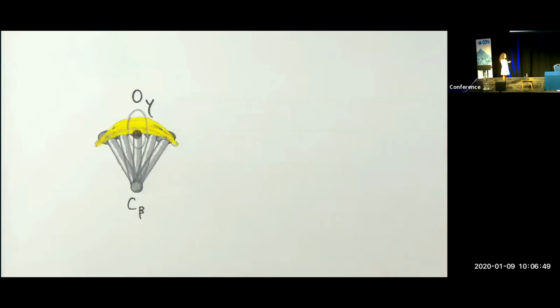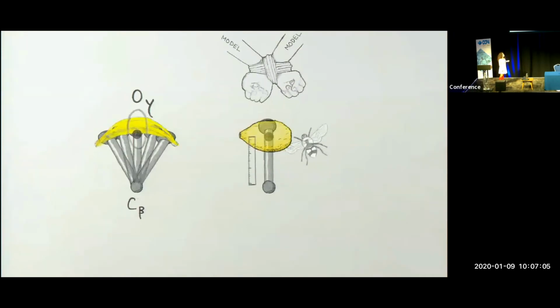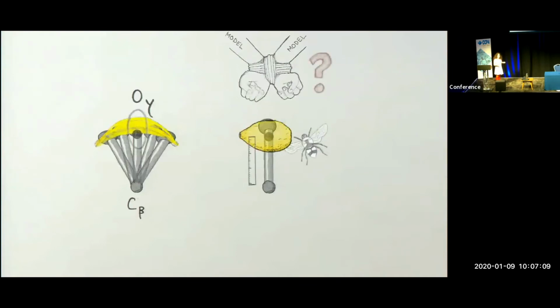And this means if we're modeling this with an atomistic distribution, then we have to place the atom at that mean position because the B factor is symmetrical, which means that there's going to be a systematic bond shortening, and this systematic bond shortening is going to fight against the model restraints. And this seems unreasonable because torsion angle should be able to freely vary, so it shouldn't be fighting against anything that we put into the model.